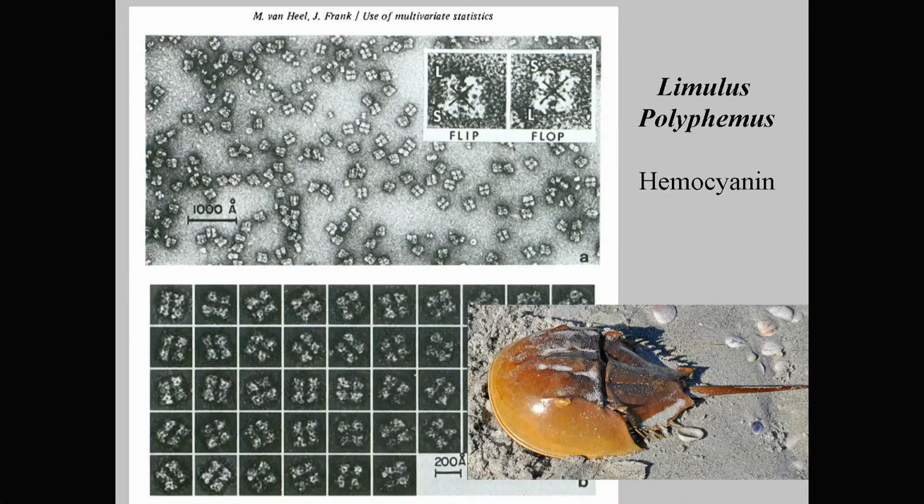I had taken from our lab in Holland samples, negative stain samples that we were looking at every day, and I had met Joachim Frank at a meeting in Basel in '77. We thought it was a good idea to have a technique to find these different views of molecules in samples, so that you could understand things better, because you get all this mixture of things. There were a couple of interesting things that I had looked at.